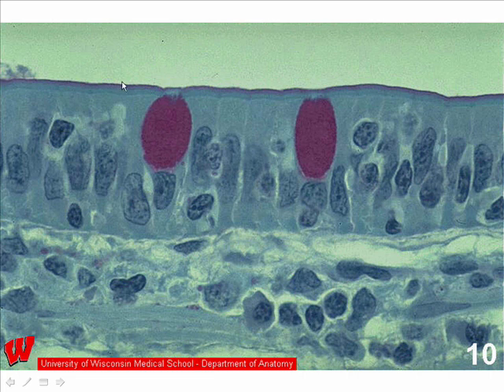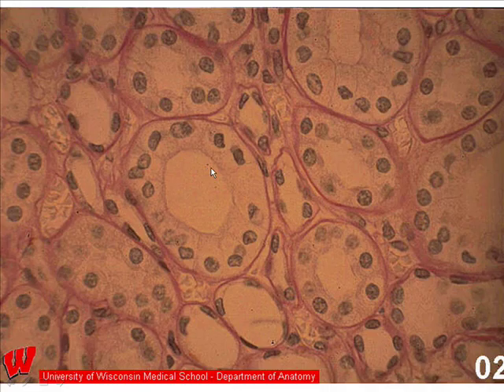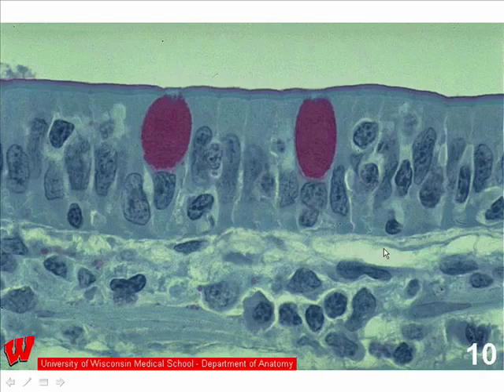So initially, this epithelium looks more complex than the previous slide. In the previous slide, things were easily determined as being simple because they have a very simple outline that defines the cell. Here, life is a bit more complicated because we have other nuclei, which I will explain to you in a moment.